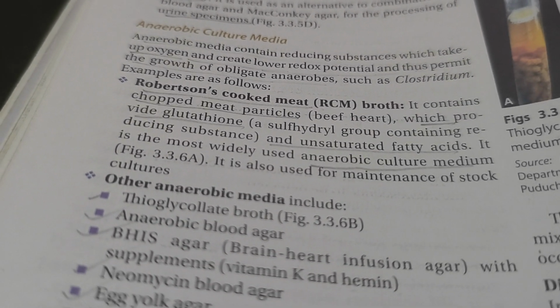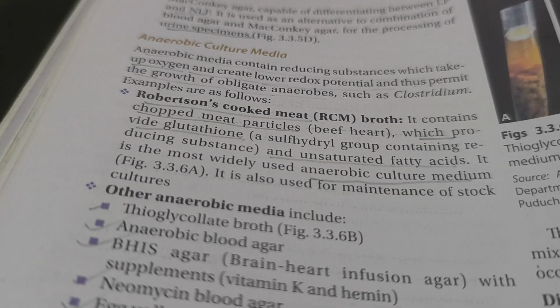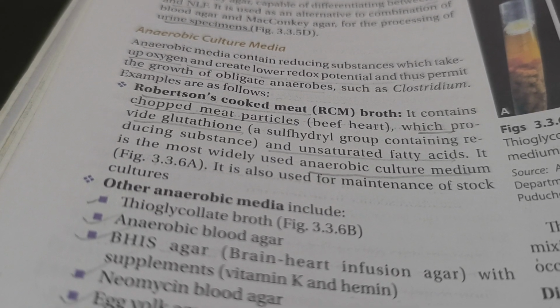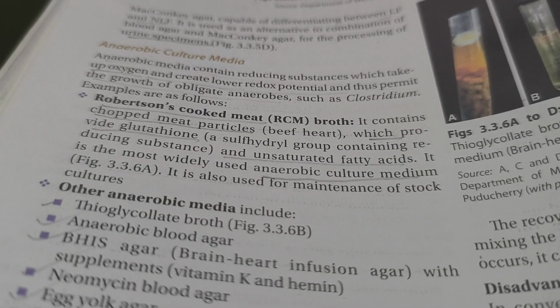So, Robertson cooked meat broth contain meat particles which provide glutathione and unsaturated fatty acids.